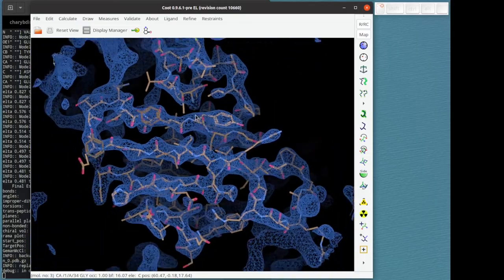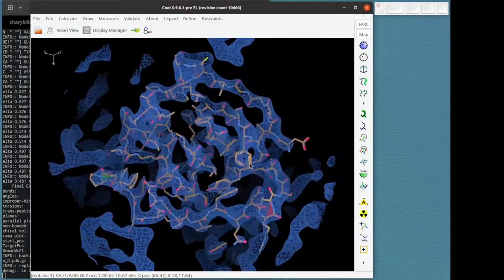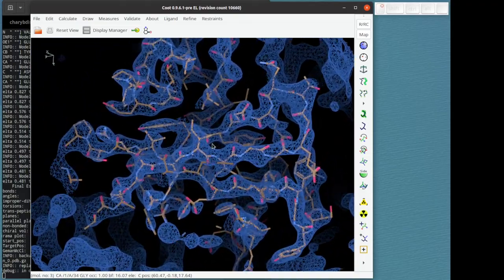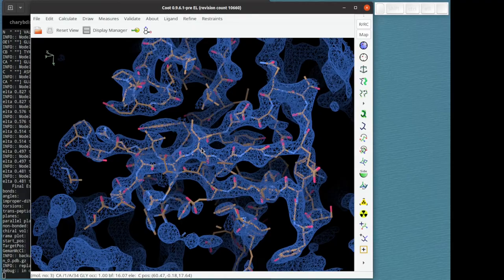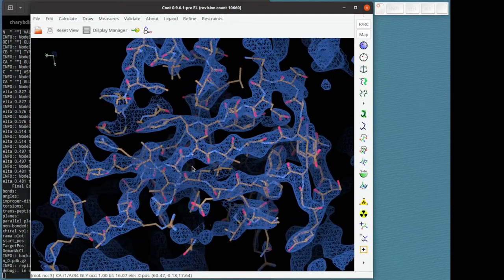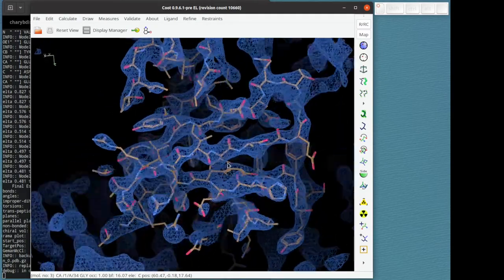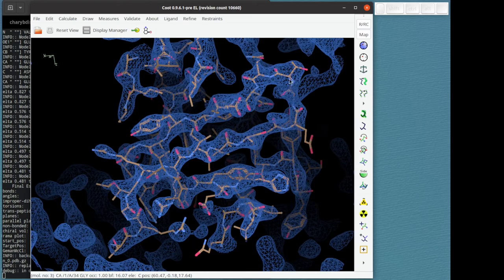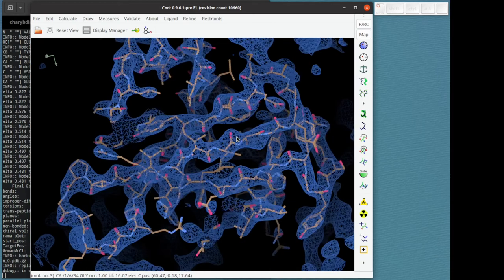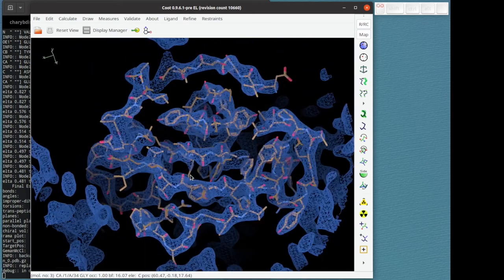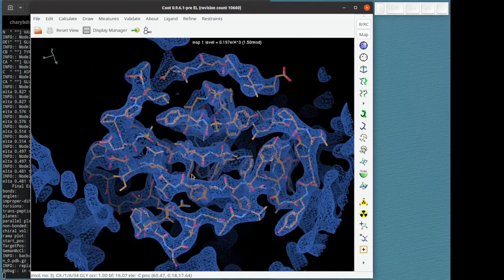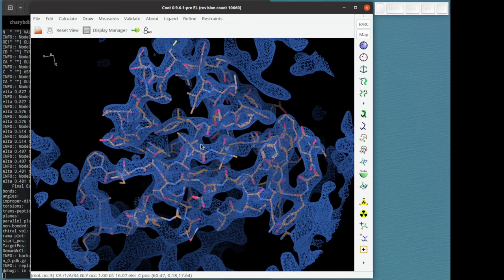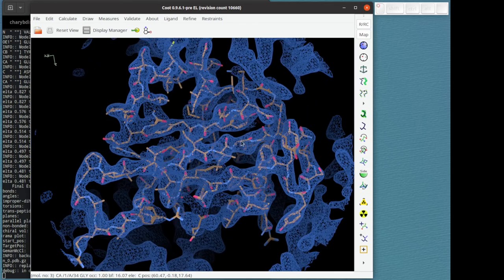That's really what I wanted to show you. The Geman-McClure restraints are working on a chain. Often one doesn't use a whole chain. You would be working on a local area, but it works, as you can see, for larger areas too.